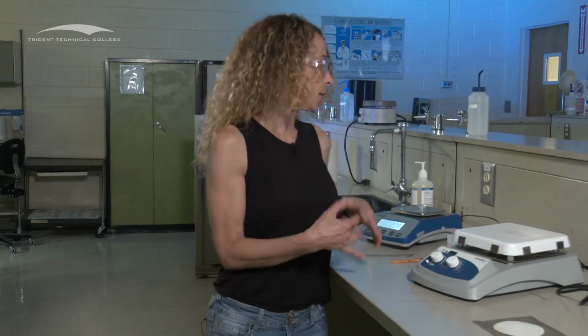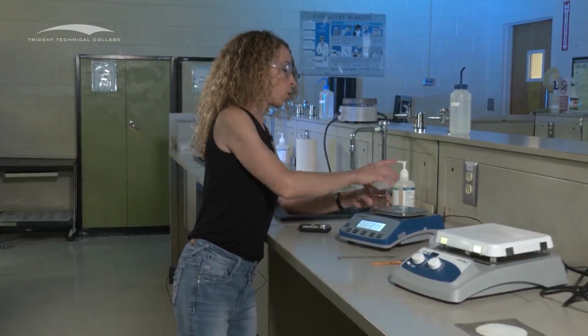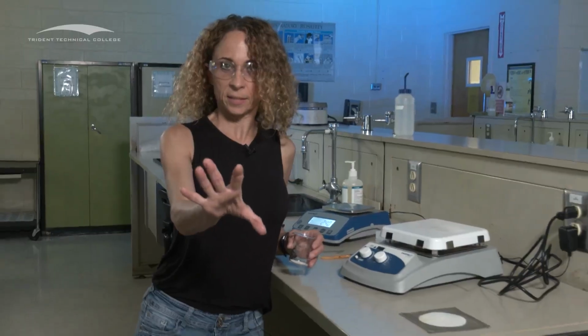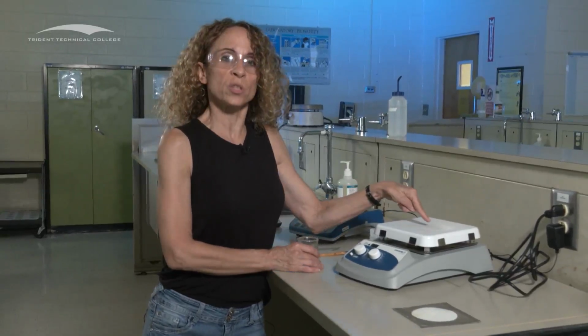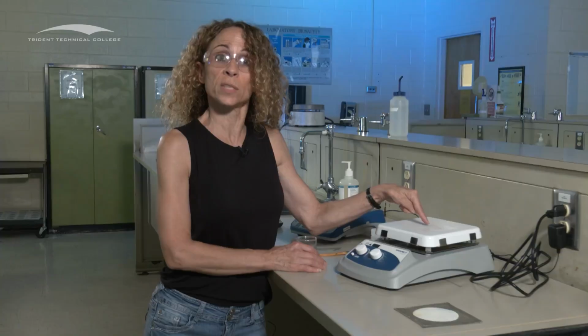And another reason why you would use this heat technique is to make sure that a reaction has gone to completion, which is why it's being used for the baking soda lab. Okay, so when you go to heat to a constant mass, you're going to have your solid in the beaker. And we're using a hot plate. The key word here is hot. This surface is going to get very hot. We're setting it to get about 200 to 250 degrees Celsius.